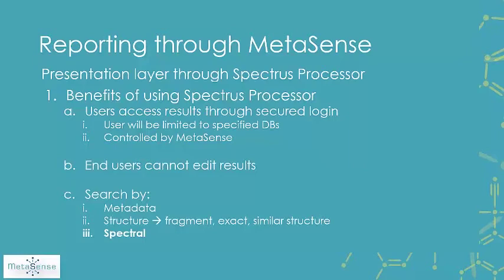As well as within Spectrus Processor, you can do spectral searching, which is nice. So again, this information is fully accessible. What we call this is that the data is not simply dead on a paper document. It's fully accessible and it can be leveraged for future use.